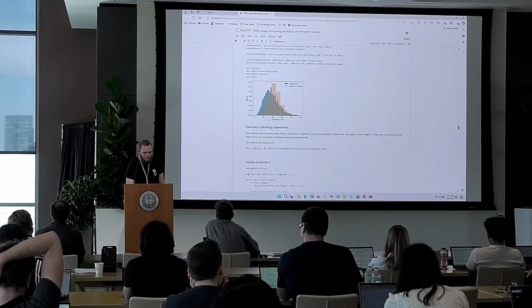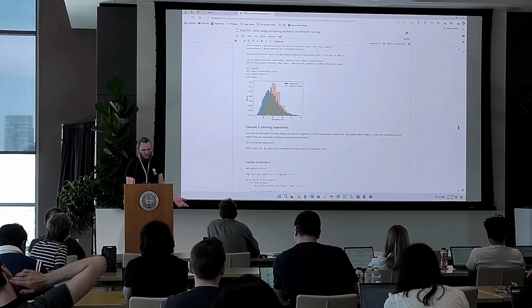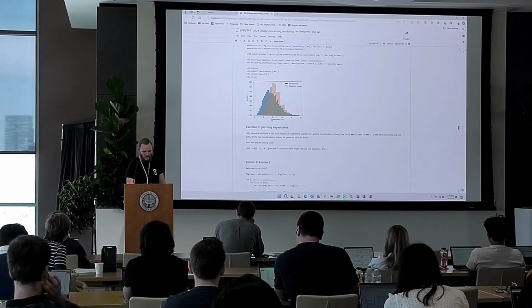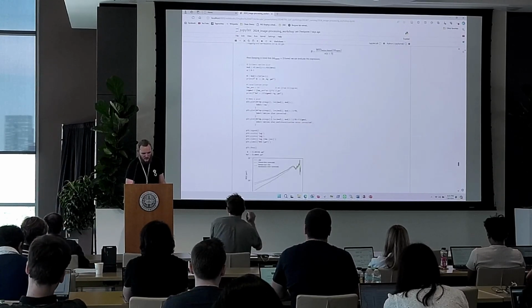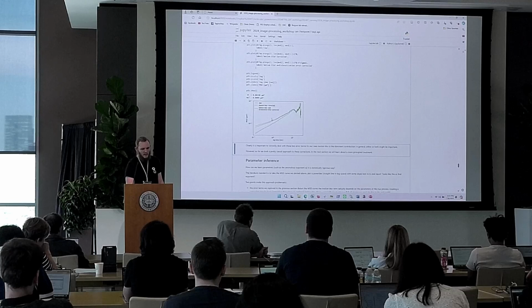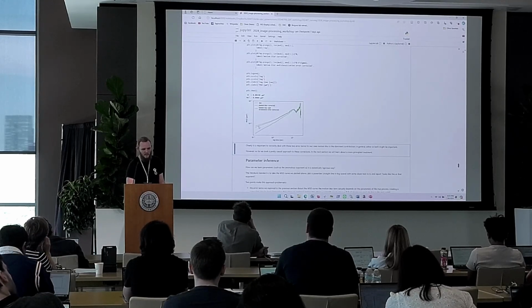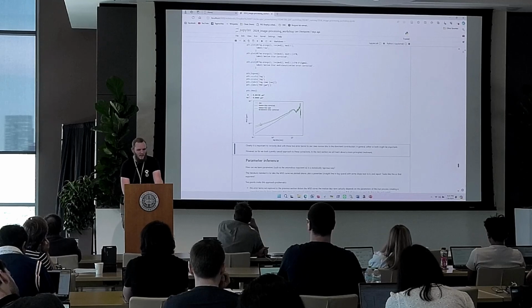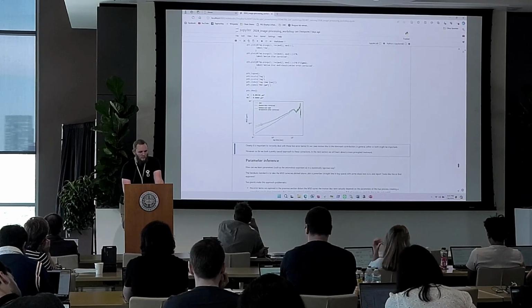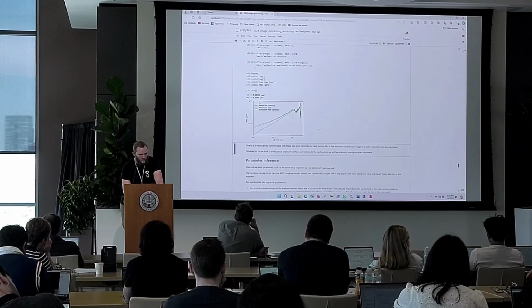Up here, we saw that Thunderstorm reports localization uncertainties somewhere around 12, 15 nanometers. And I just used that in this analysis to subtract localization error, essentially to make the point that localization error is a smaller contribution than motion blur in this specific data set. Of course, in any other data set you have, that might be different, and either one of these contributions can be the more important one, or maybe both of them.